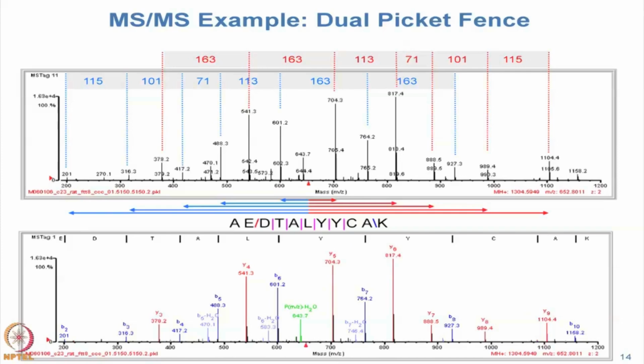This comes from an older instrument where we don't have low mass available to us, okay? This is a tryptic peptide, okay? So that means it's very likely to have a C-terminal amino acid that is arginine or lysine, okay? The Y1 mass for arginine is 175. The Y1 mass for lysine is 147, okay?